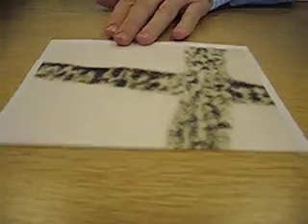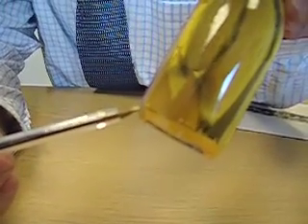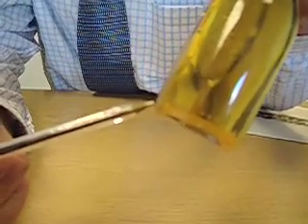Magnesol that may still be present inside a sample will always gather to the base and form a thick bed — a dark bed. It'll always be very brown, as it's absorbing impurities from the fuel all the while.